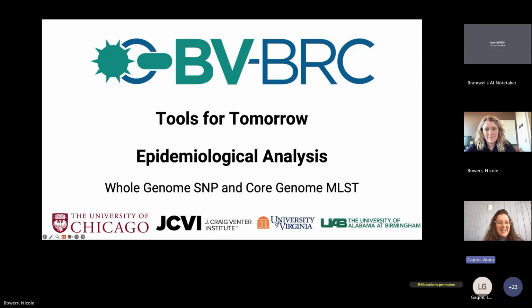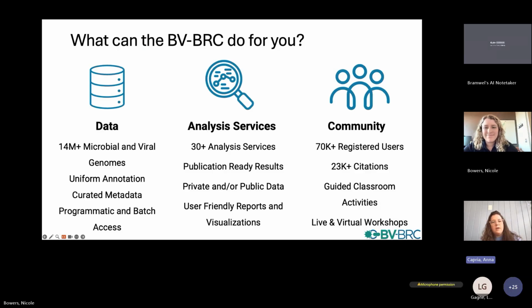BRC is going to be talking about our epidemiological analysis with our whole genome SNP and core genome MLST services. So we're very glad to have you here for this.